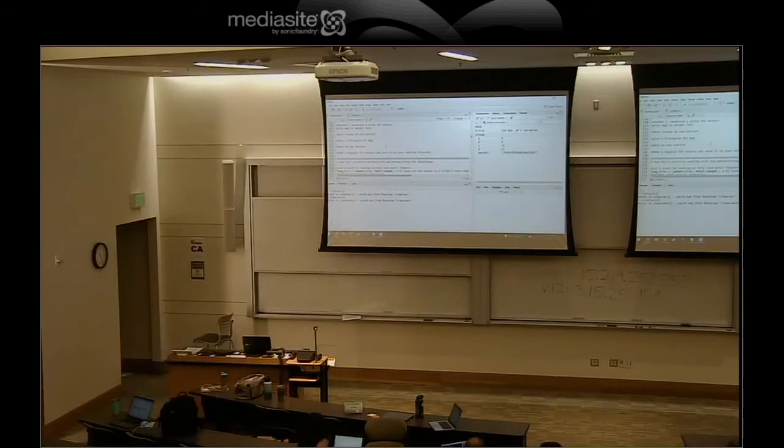No, no, yeah. Hold on a second. Oh, so it's using forward slash. No. Oh, this is the base generate. Yeah, so backslashes will not work with R, forward slashes will not work with Z. But they equal the same. Okay, yeah, I can use a backslash. In R you need to use that. Oh, okay, that's correct. Yes. The one that goes like this.